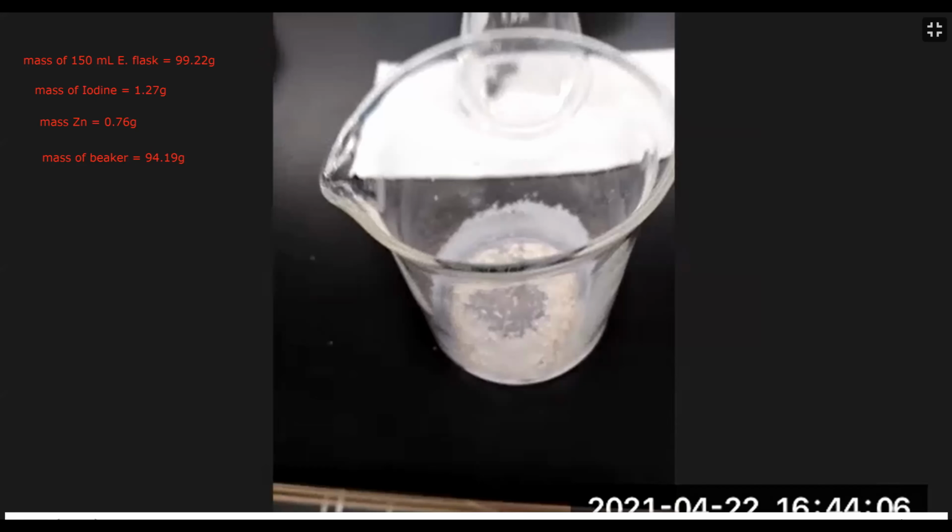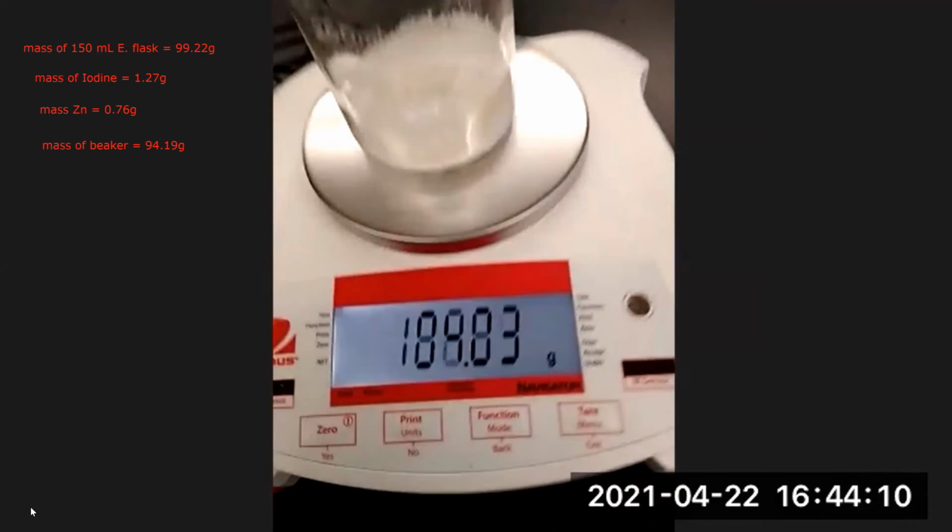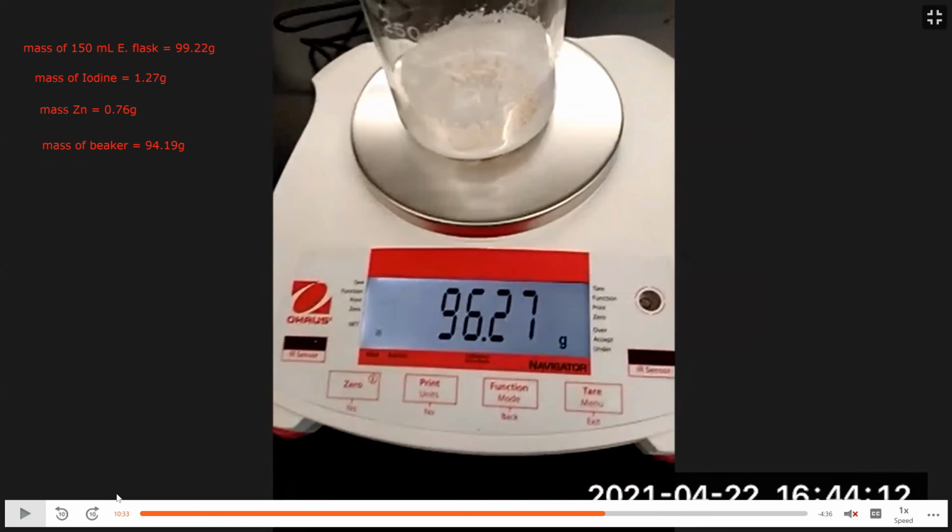So now both the unreacted zinc and the product are dried. We're going to record the mass of each. The mass of the product and the beaker is 96.27.